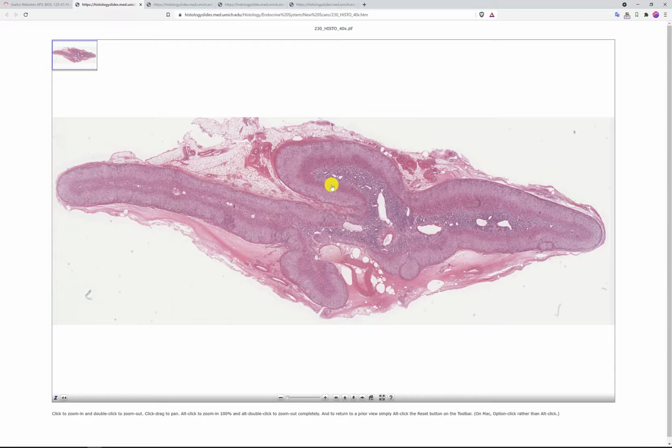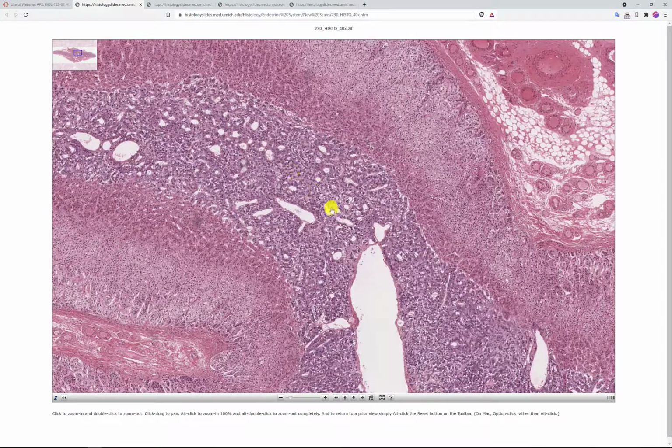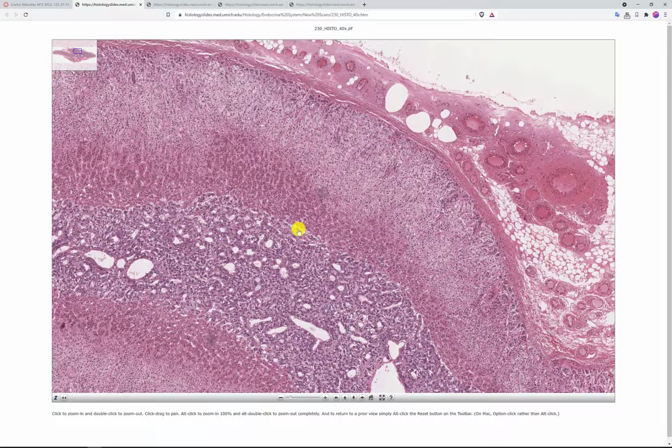And if you remember, the adrenal gland is made out of two things, the cortex and the medulla. If you are looking at this area, you will notice that there are two different colors. Here, the inner part is the medulla. This is the first thing when you are looking at the slides: find the medulla, then move to it, zoom into it. Once you are there, you would know that this is the medulla, this is the border of the medulla, this is the other border, and everything above it from here to here is the cortex.